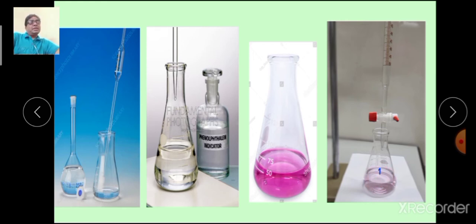As the acid is added to the alkali, first neutralization of alkali takes place, and a further drop of the acid changes the color of the phenolphthalein to colorless, because in acidic medium it has no color, while in alkali it has a pink color. Thus the end point is reached, that is, the required amount of acid is added for the neutralization of alkali.